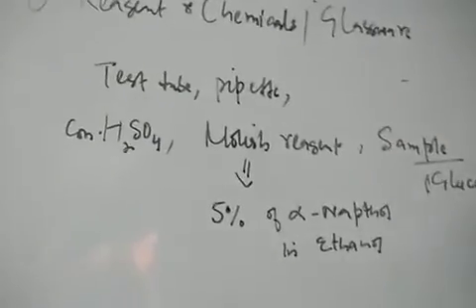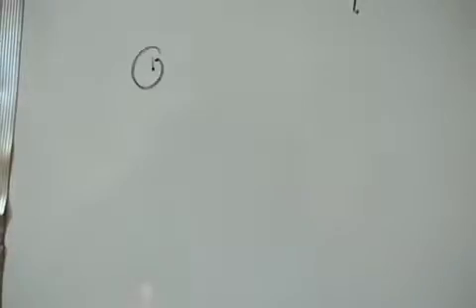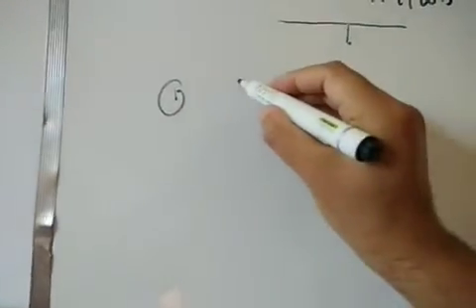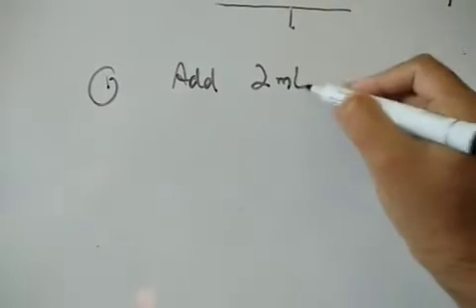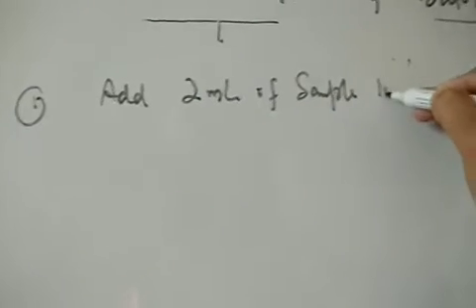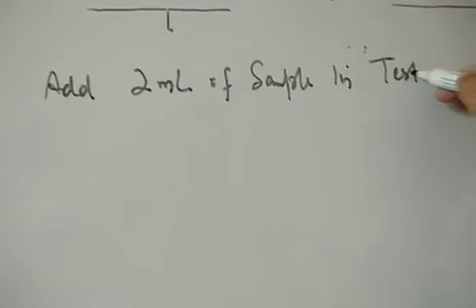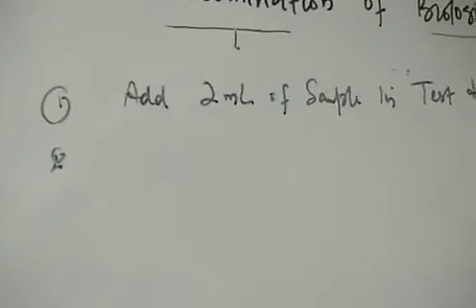Now what we'll do? We'll do this in step number 1. Add 2 ml of your sample in a test tube.